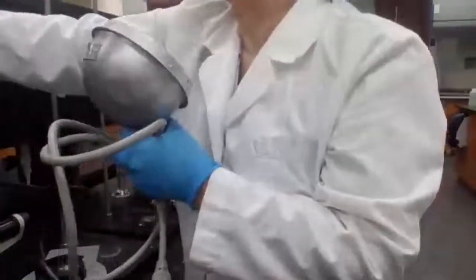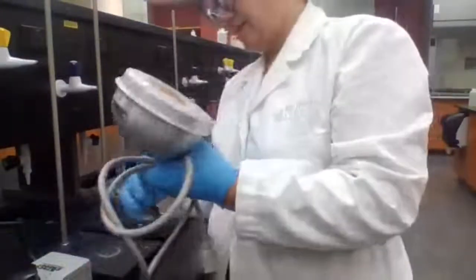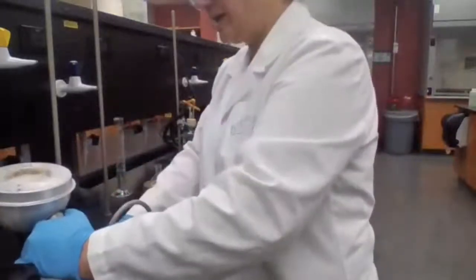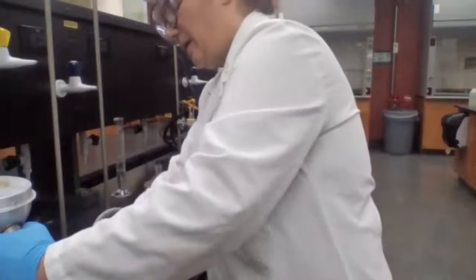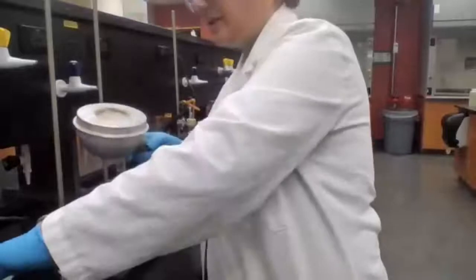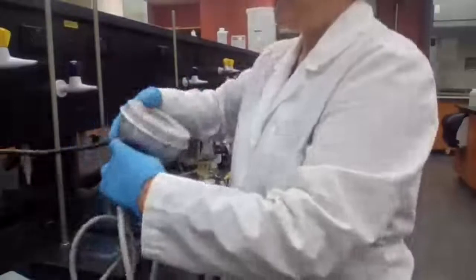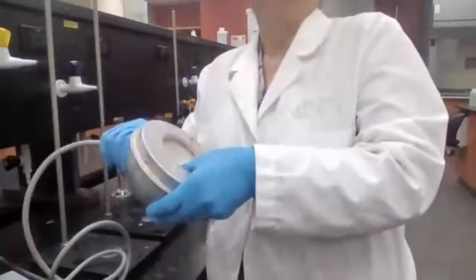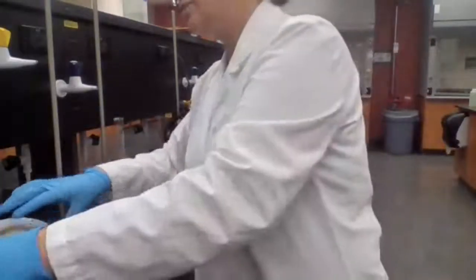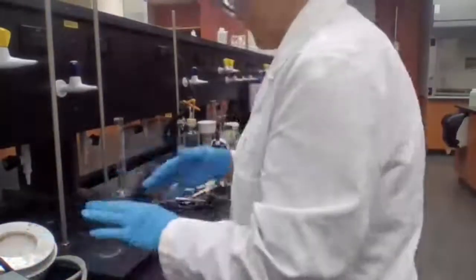Simple distillation apparatus. Hardware first, glassware second. I want to make sure my heating mantle is actually working before I set up everything, because if it doesn't work and I find out in the middle of the experiment, I lose the time. I have to disassemble it. So, to make sure it's working first. Okay, it's warming up, so it's working.